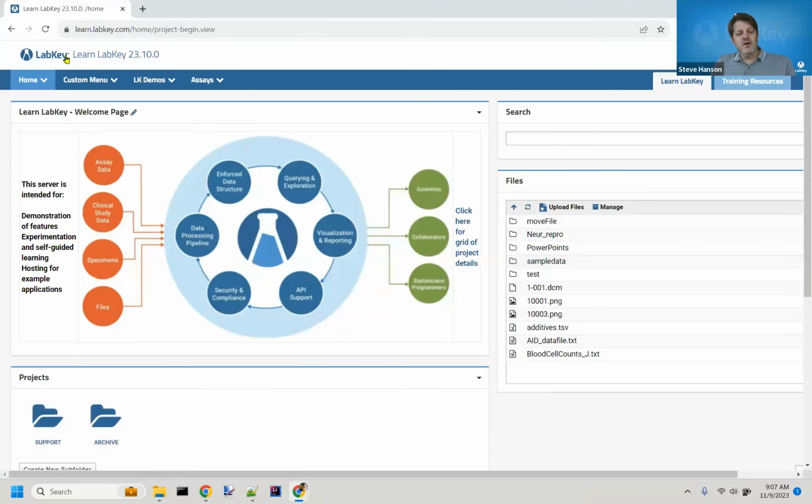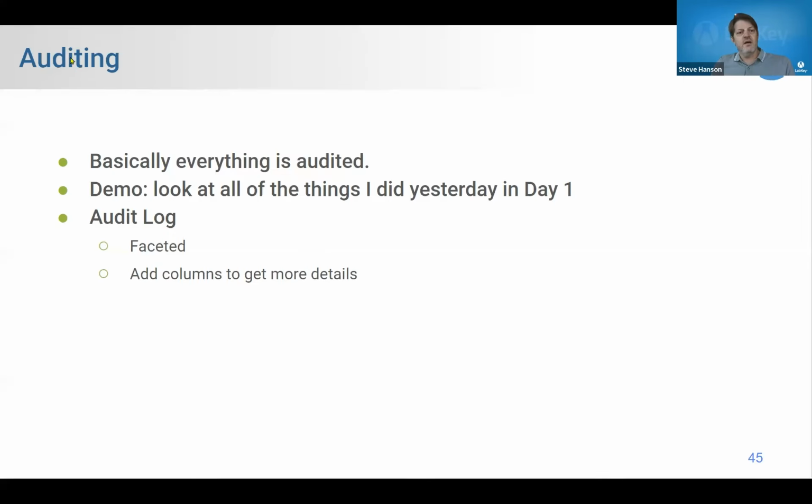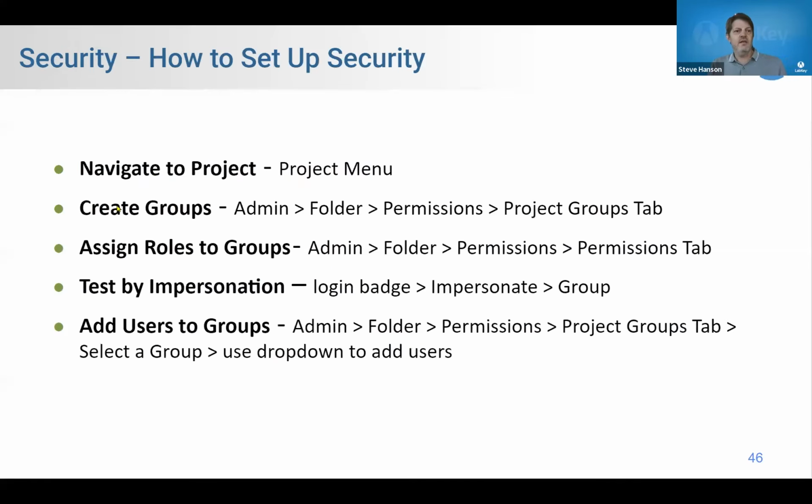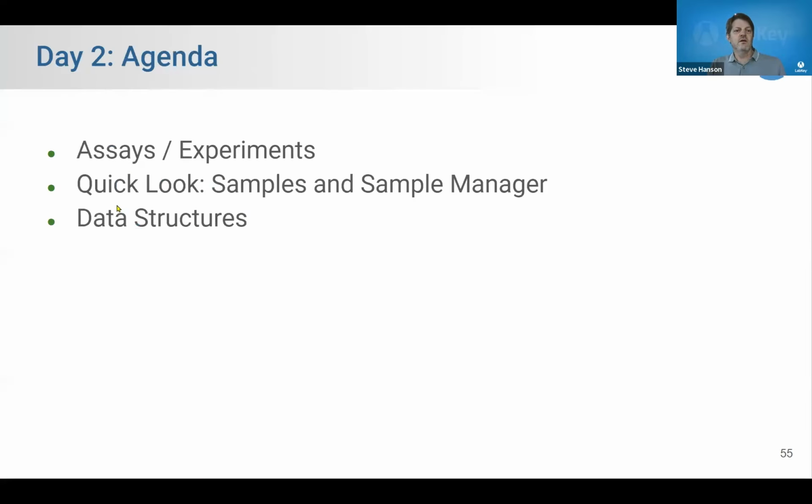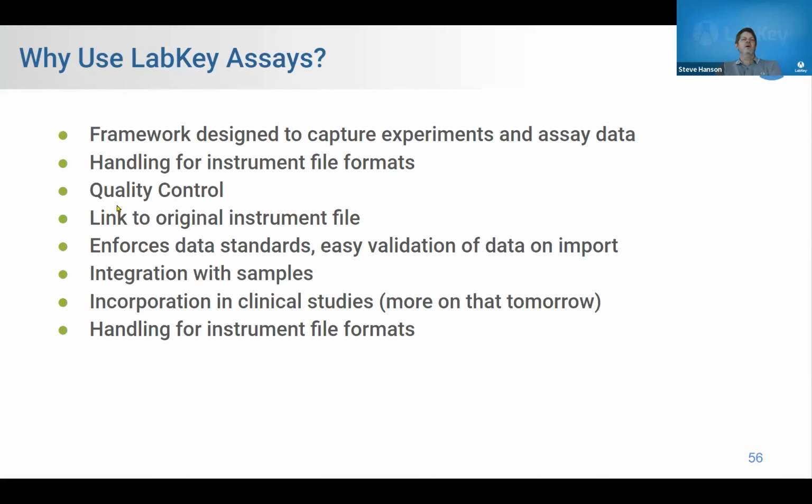And let's go on to our agenda. The real agenda today is assays and experiments. So, LabKey assays. This is really the most complex part of the server.